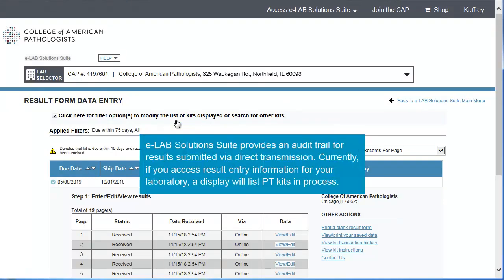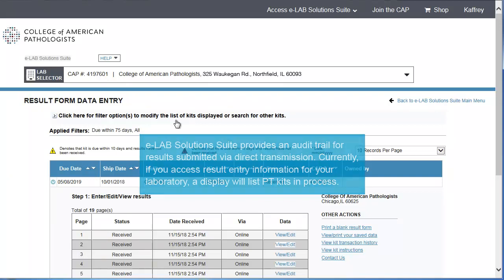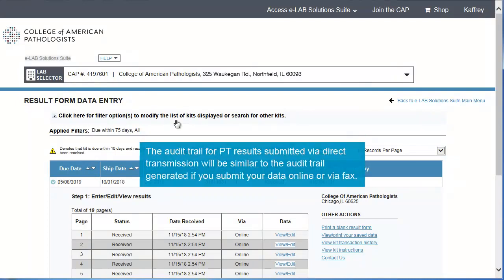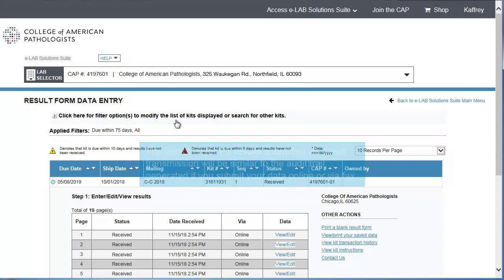eLab Solutions Suite provides an audit trail for results submitted via direct transmission. Currently, if you access result entry information for your laboratory, a display will list PT kits in process. The audit trail for PT results submitted via direct transmission will be similar to the audit trail generated if you submit your data online or via fax.